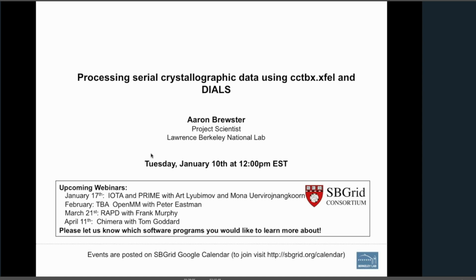This problem is resolved. So the detector position gets shifted slightly into the right position, and we're able to narrow the distribution of unit cells, even if the axis is parallel to the beam. So it's a really cool result, and we're really excited about it. And then we integrate. Cool. And I hope I see the paper when it comes out. Yeah. I want to mention also when we integrate using these new models, the I/O sigmas also go up quite a bit. So we're happy about that.